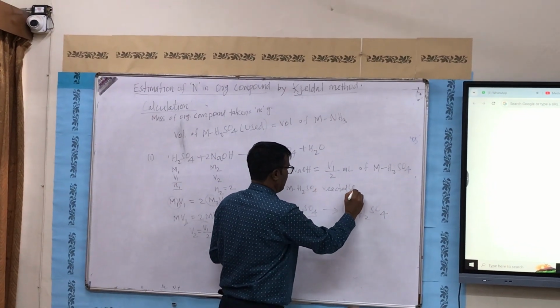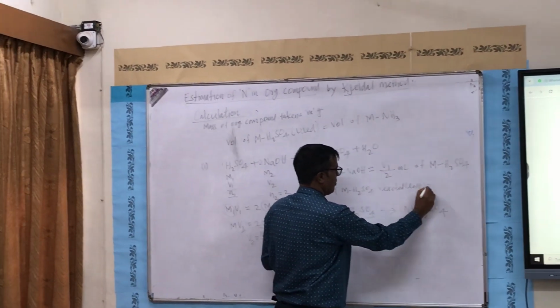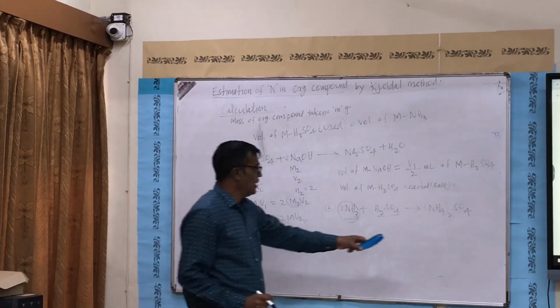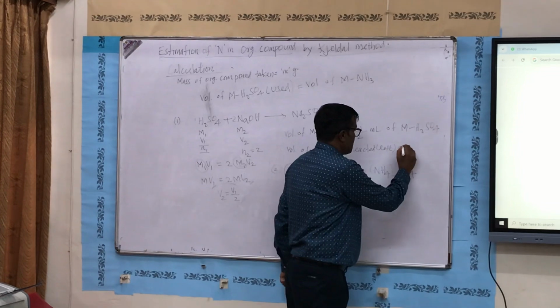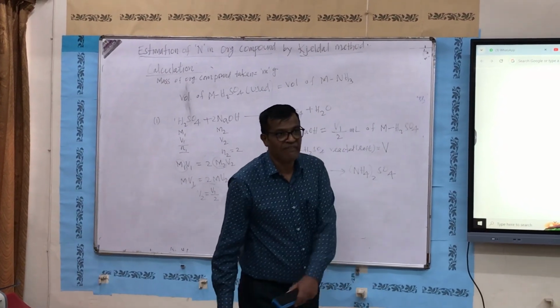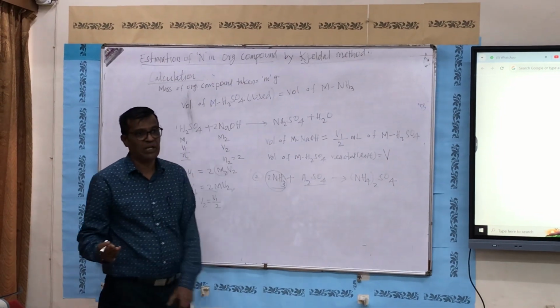Can you tell me how much? Initially I told, standard sulfuric acid solution, how many ml were taken? Either 100 ml or 50 ml.